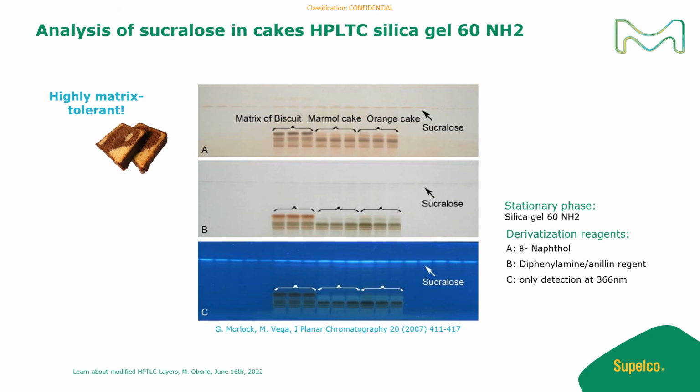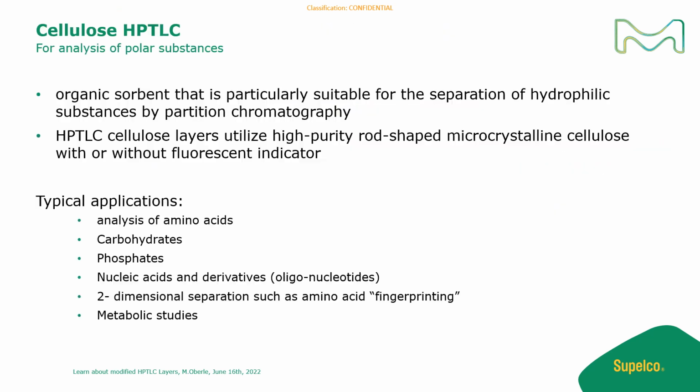On my last slide, I will give you a short overview of the use of cellulose plates for the analysis of polar substances.